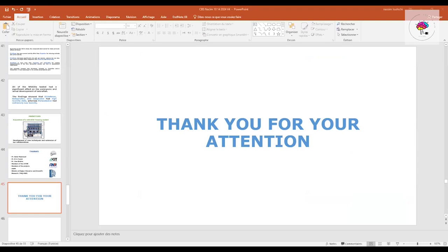Elle est fonctionnelle, donc, la plateforme. Oui, elle est fonctionnelle, juste on est dans la contrainte d'avoir toujours un approvisionnement continu en poissons adultes. Mais on fait avec les moyens du bord, c'est le système D, toujours.